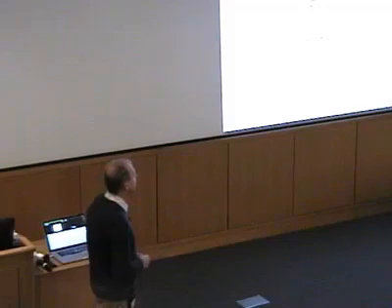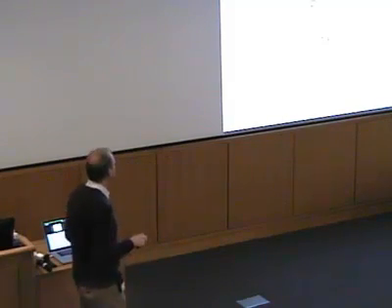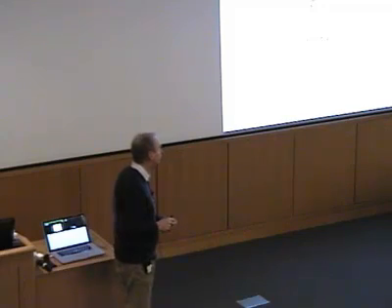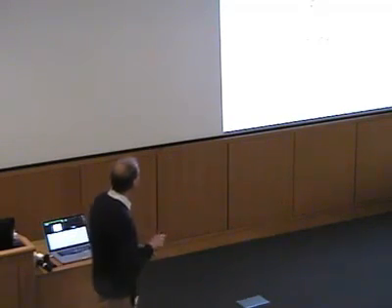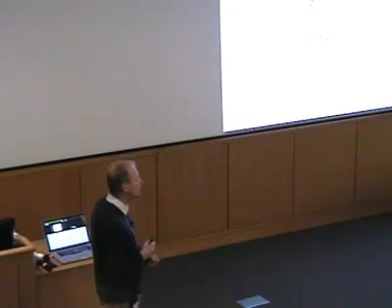Okay, so just to give you some idea how that works, if we're in the very fortunate situation where we have a single crystal of our sample, right? So if we've managed to take our protein and crystallize it and get a really good single crystal, then we can actually measure this orientation dependence by mounting the crystal onto some kind of a rod known as a goniometer, so that we can put the crystal in a predefined orientation in the field.